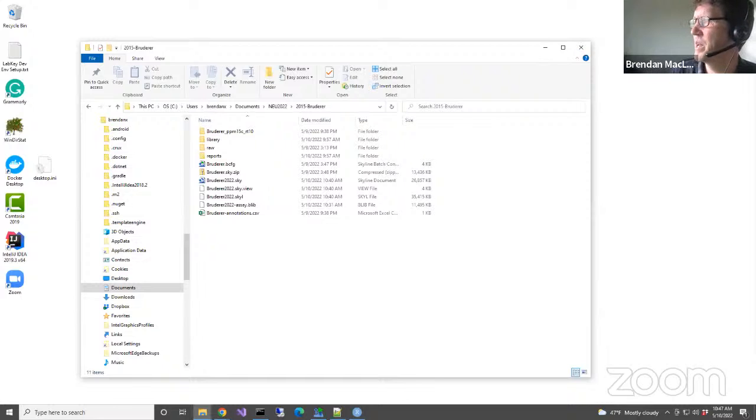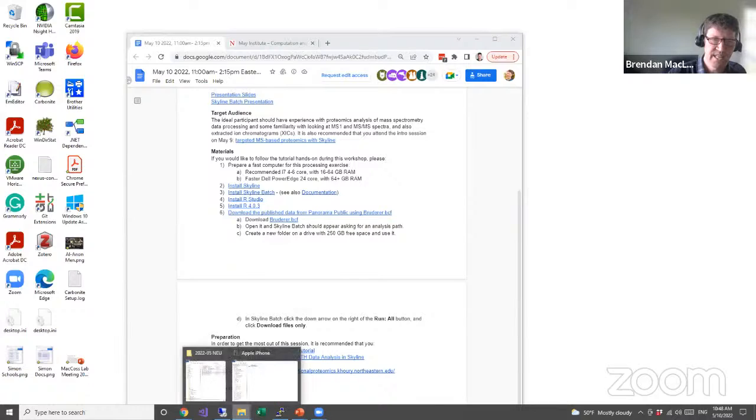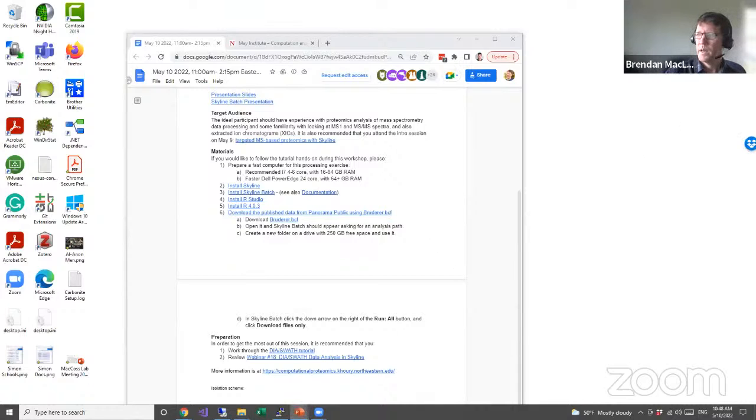All right, so I think most people ought to be back by now. I'm going to stop answering questions and get on with Skyline Batch. I've got to open the presentation for that. All right.